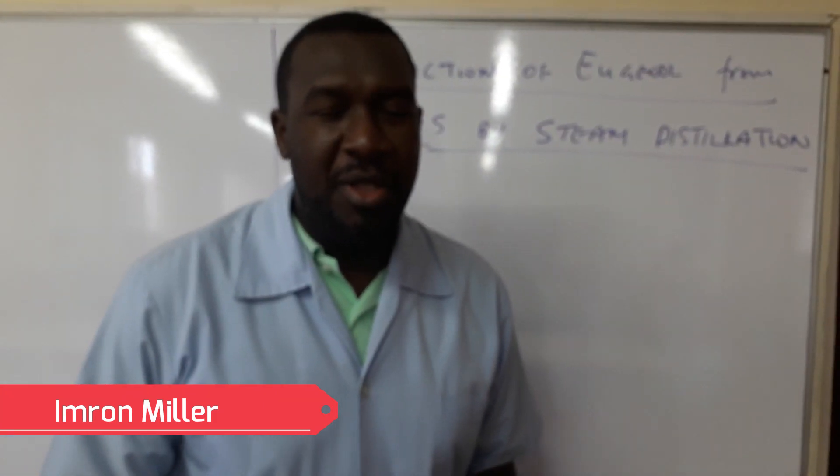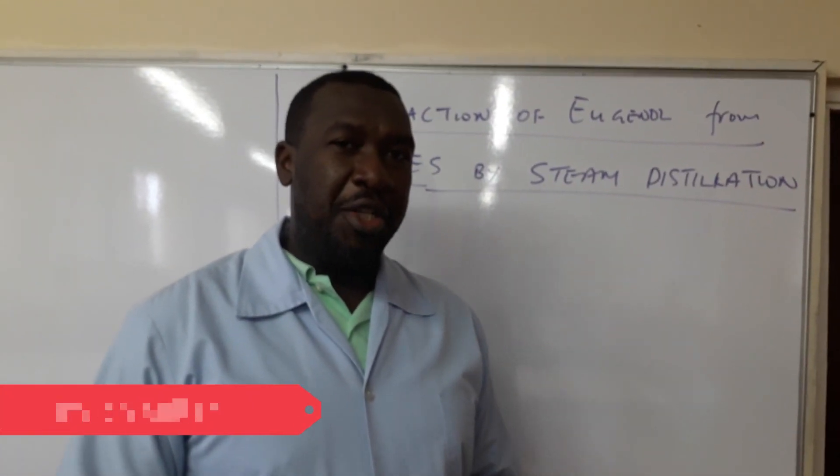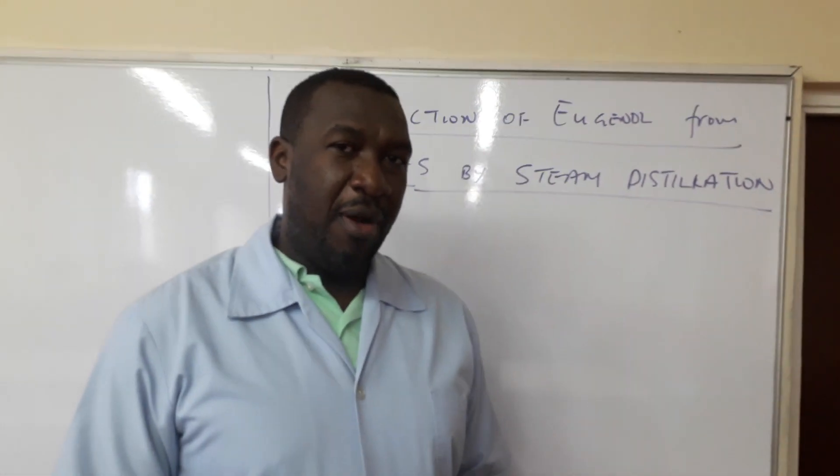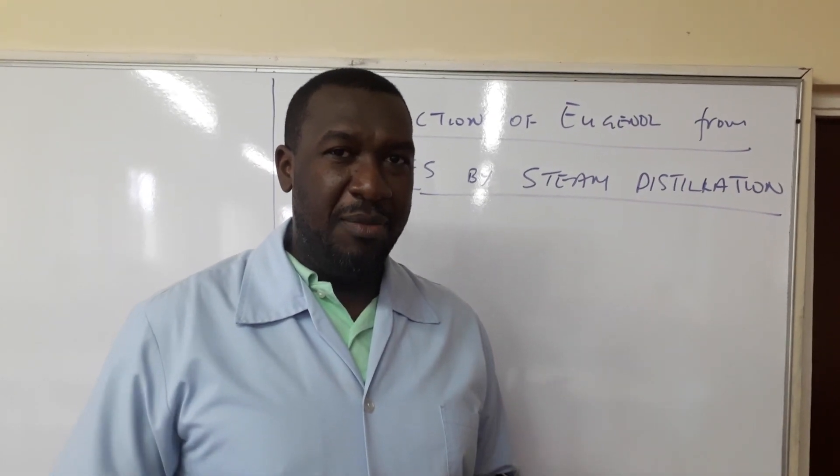Today, we are going to be looking at extraction of eugenol from cloves using steam distillation.